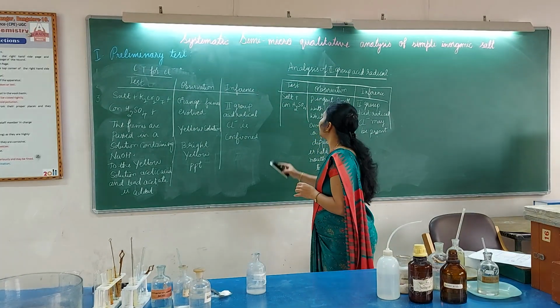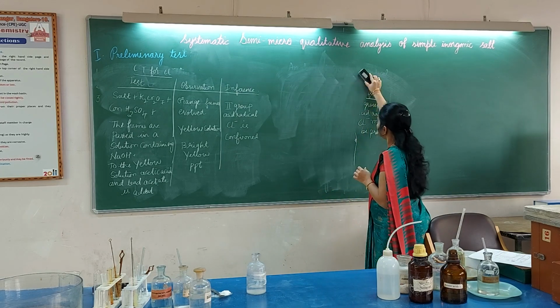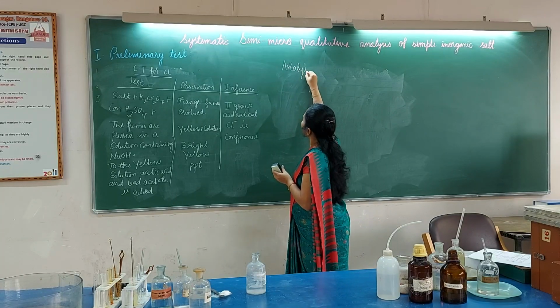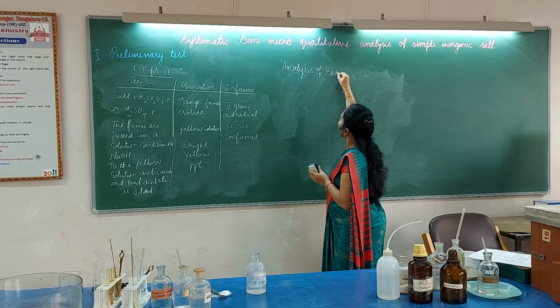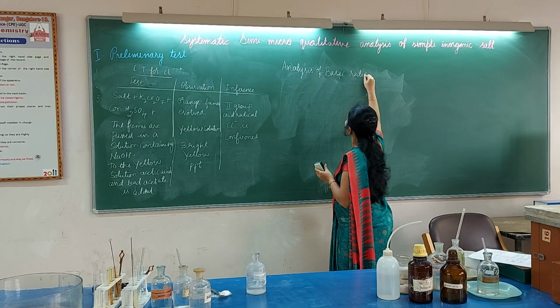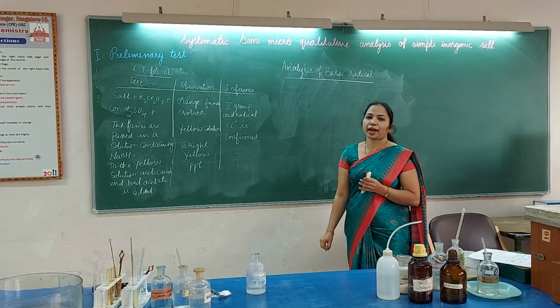So what you have to write is analysis of basic radical.